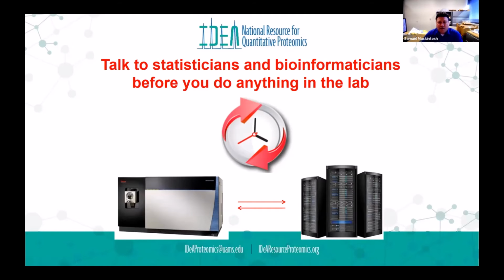Any questions that you're going to have, anything you want to get out of the data, you want to make sure the people who are going to analyze the data know about that before it gets all the way to that point. And it turns out that we really needed 5 replicates to answer this question satisfactorily, and we just spent a lot of time and money on a 3 replicate design. So you want to avoid that kind of thing.